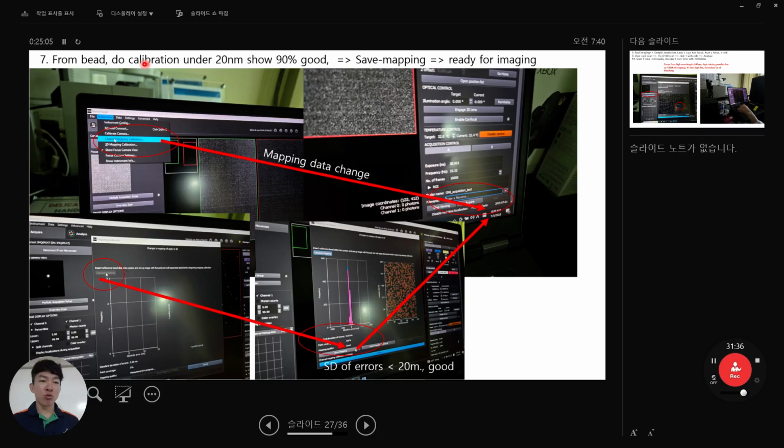Your imaging: sample installation in the same box, laser intensity, XY Z axis focus, autofocus, auto Z focus, and Z lock scan. First, this machine has only one magnification, 63x, very high, so you cannot see the overall sample. That's why you have to do an overview scan first. From the overview scan, you click one site, and then you can do an edit scan. It will take just 1 minute.